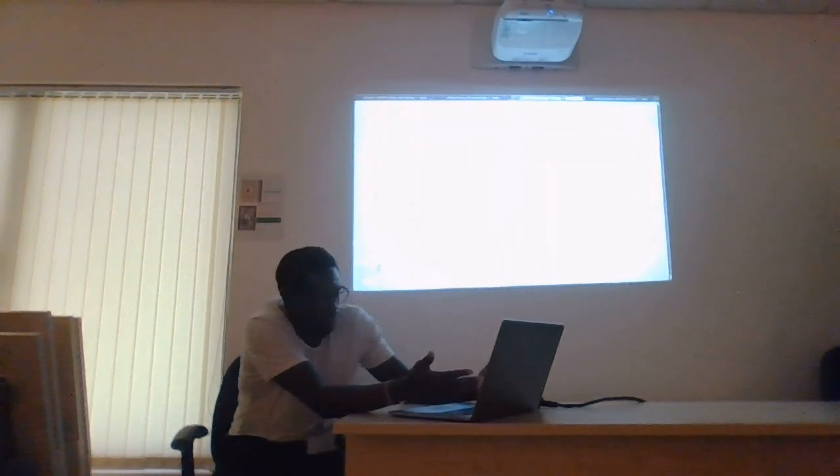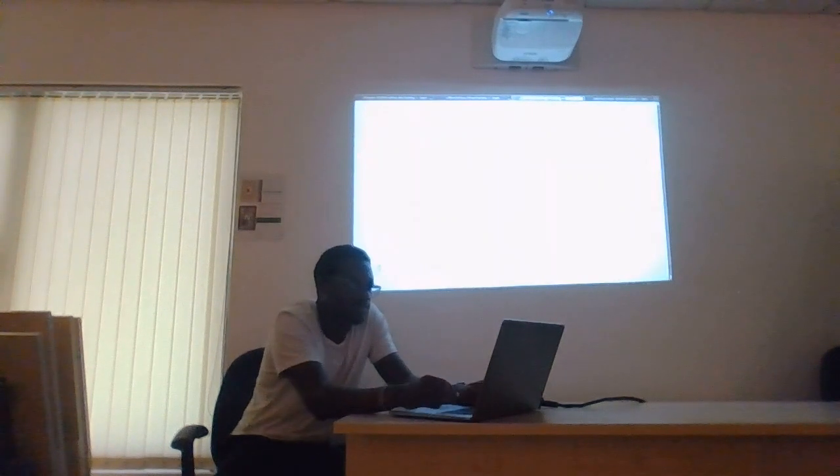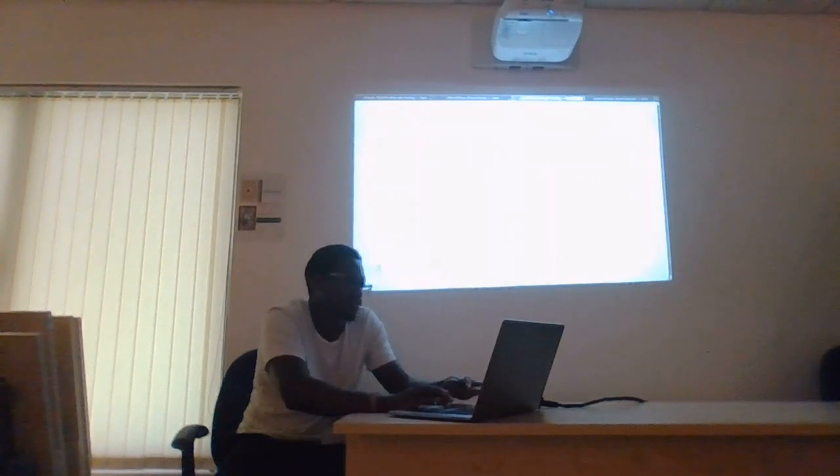So now, how should we call the output of this? It's going to be a channel, definitely, but any name can suffice because it's going to be the output channel emitted by this process.